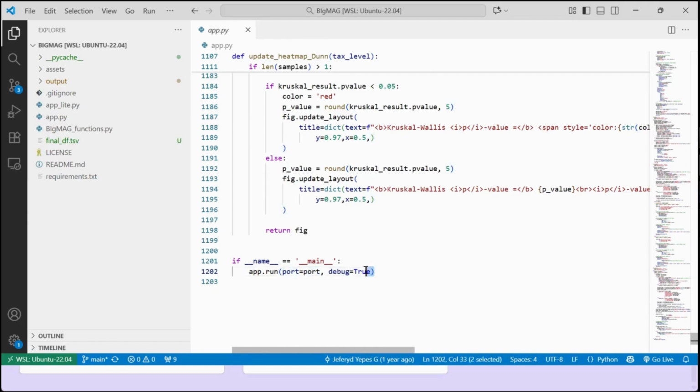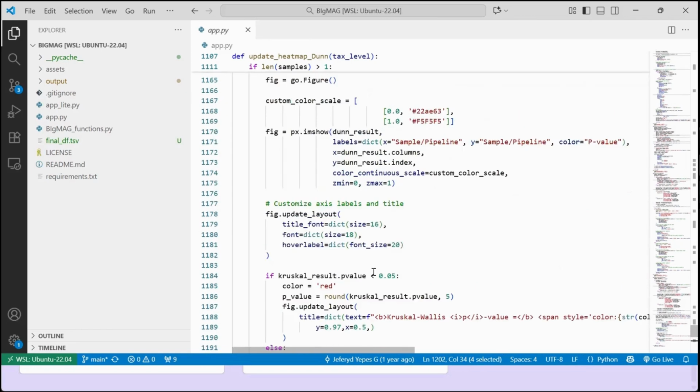And this one is if you want it to be updated each time you modify something, you can leave it as true, or if you want to maintain it and not be affected by anything, you can change it to false. So this is an example that is big for an introductory course, but this is how at the end you can rely on Dash to build and show all of your data and how you want to perform the data visualization.